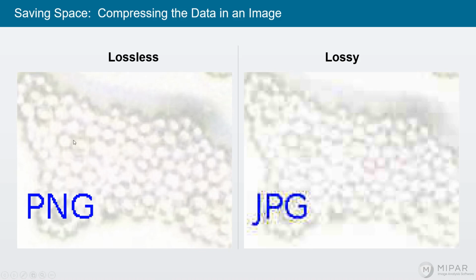But here's an example of PNG versus JPEG compression. We have our cells here, and you can see all the detail in the cell that the lossless image compression preserves. The lossy JPEG compression, we see the blocks that it broke the image up into, and then the approximate description in those blocks, so the lines don't add up properly. A lot of the fine detail within a block is lost. So this is a pretty extreme example of JPEG compression. I think I have 15% quality here, but it demonstrates the point that you don't get a perfect representation out.